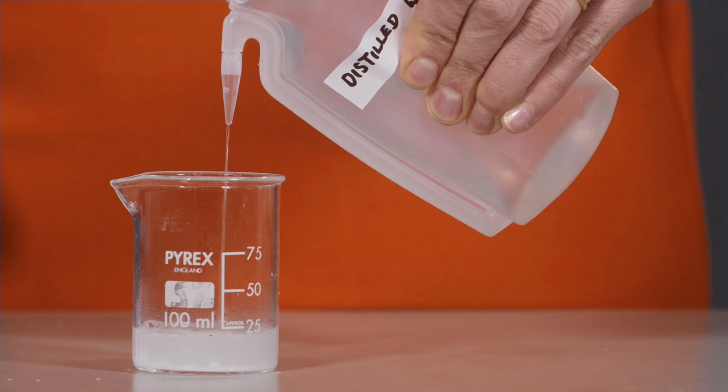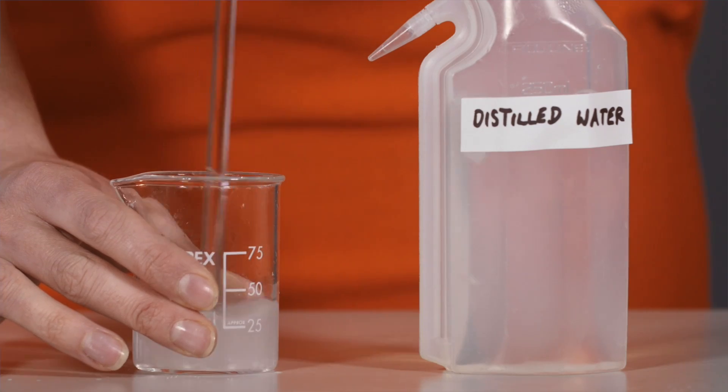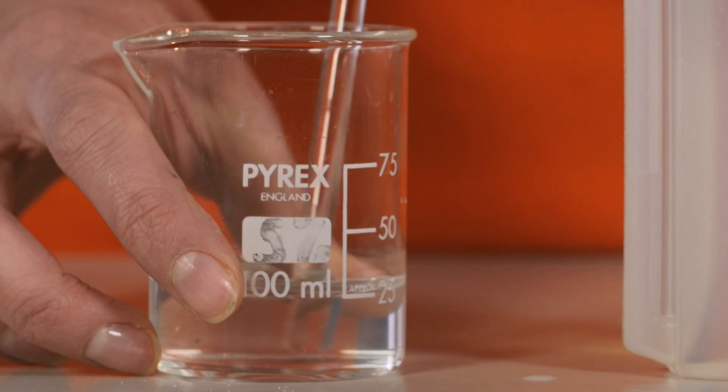Next, take this anhydrous sodium carbonate and dissolve it in distilled water from a wash bottle. Stir this solution thoroughly until the solid is completely dissolved.